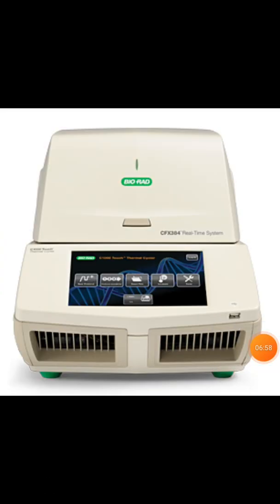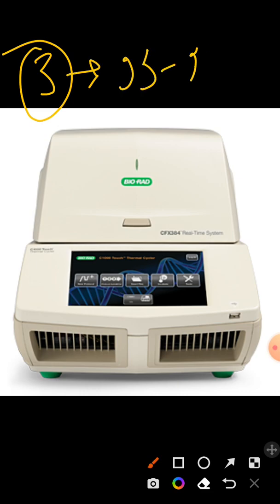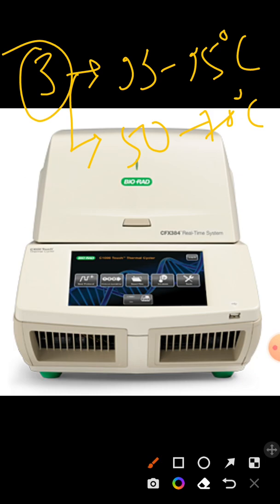So this is a thermocycler machine, commonly known as a PCR machine. What is the utility of that thermocycler machine? It has the ability to change the temperature. Remember, in PCR, in each cycle there are 3 steps. One is the melting step, at about 93 to 95 degrees centigrade. Another is the annealing step, at 50 to 70 degrees centigrade, depending on the Tm of the expected duplex. We are going to discuss this. And the last is the DNA polymerization step, where we keep the temperature at 74 degrees centigrade.